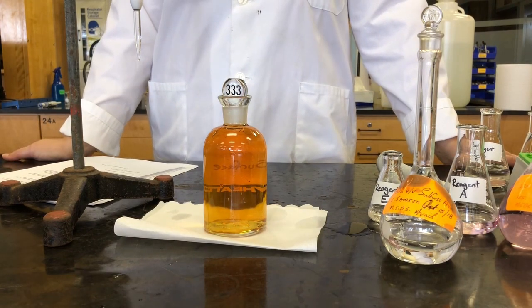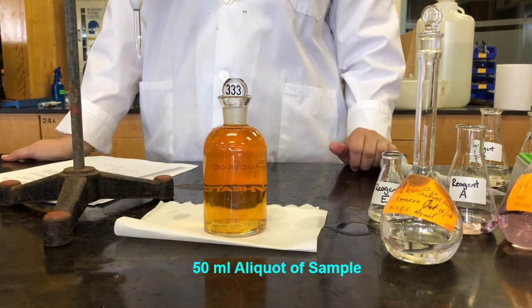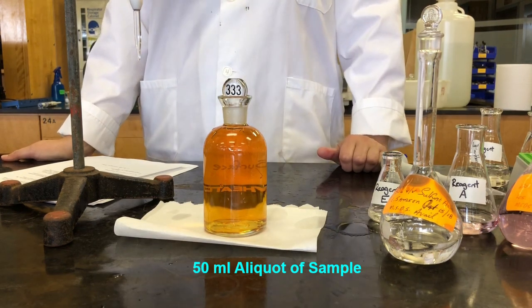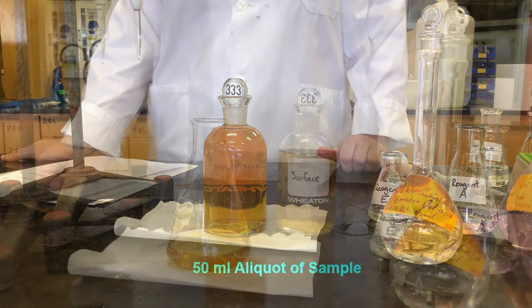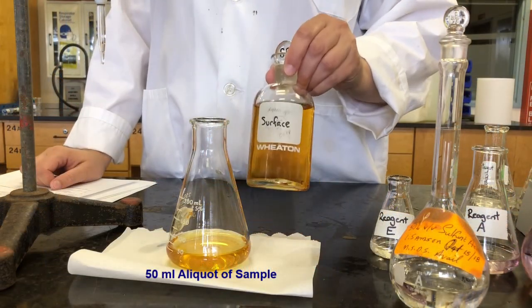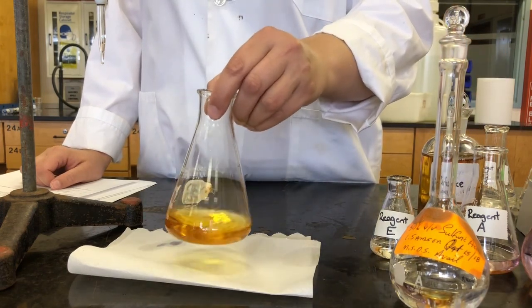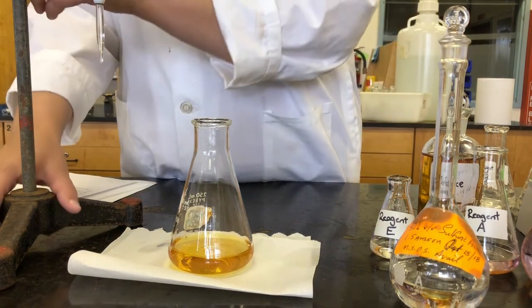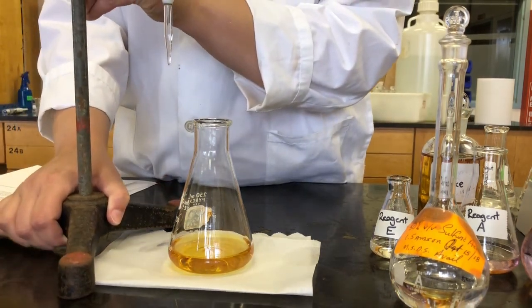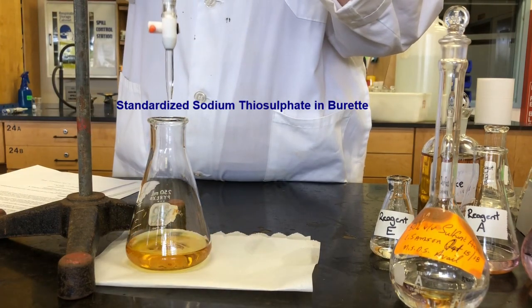So I'm going to take 50 milliliters from this sample and transfer it to an Erlenmeyer that we can use to titrate with the sodium thiosulfate. Okay, so I've taken 50 milliliters from our sample bottle, put into a clean Erlenmeyer flask. You can really see the nice yellow color of the iodine here now. So now we're going to titrate with our standardized sodium thiosulfate solution. So the sodium thiosulfate is still in the burette.